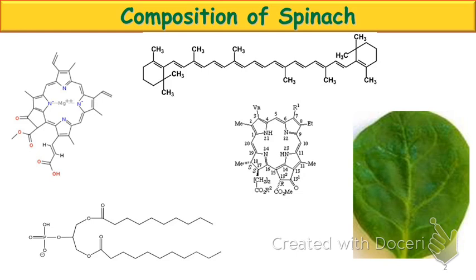Well, spinach in this case doesn't produce only things to make Popeye strong. It's got a bunch of other things involved in it, right? We don't want those other things, so we've got to come up with some way to get rid of them. Okay? What's the easiest way to get rid of them? The thing that we should be relying on to figure out how to get rid of them? Rhymes with horses. Intermolecular forces. Okay? So what we'll do is go back to the structures and see if we can figure out some information about them so we can figure out some way to separate them away from each other.